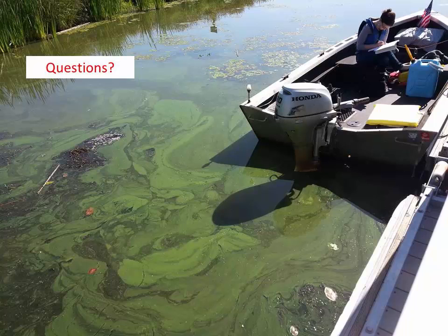This is the lake in Oregon that I've been helping watershed councils with. And actually, we have samples back there that I want to use in the ID part to show you how to use the dichotomous key. So that's why that slide is there.